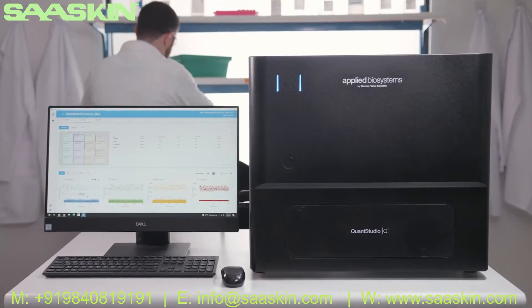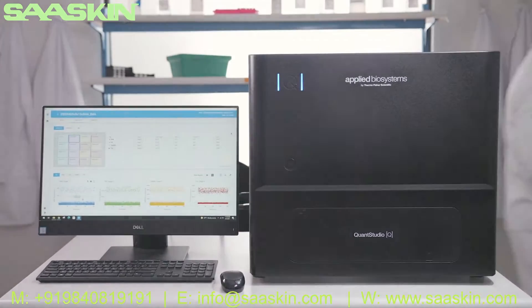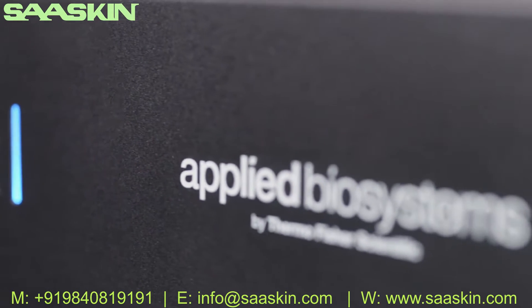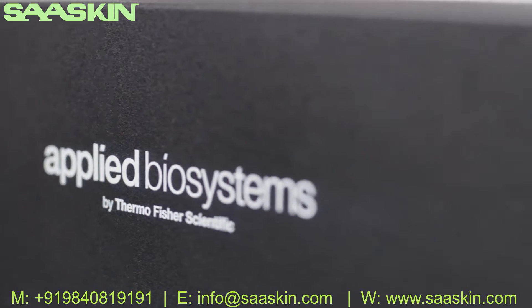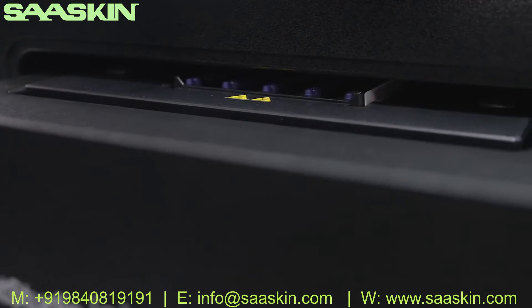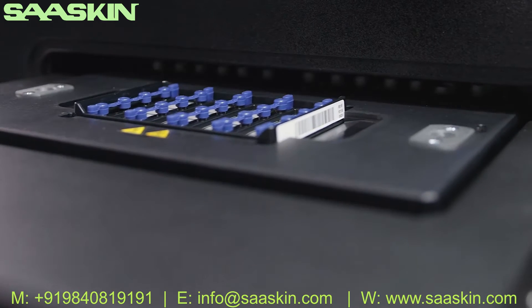Introducing the newest member of the QuantStudio family: the Applied Biosystems QuantStudio Absolute Q Digital PCR System from Thermo Fisher Scientific. This fast and easy-to-use digital PCR solution offers high-quality data with minimal hands-on time.